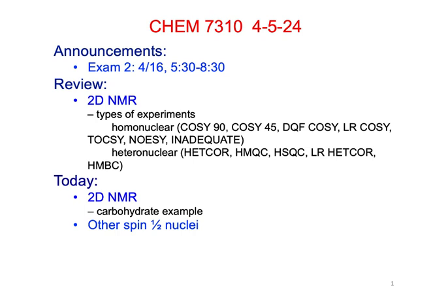What we were going to do today is briefly go over the last slides for the 2D-NMR. They're just some examples, and actually they're much more relevant if Dr. Chang's group was in here. But we'll take a look at those because they're an application of everything we've been doing. And then we're going to go into the chapter on other nuclei, actually other spin 1/2 nuclei.